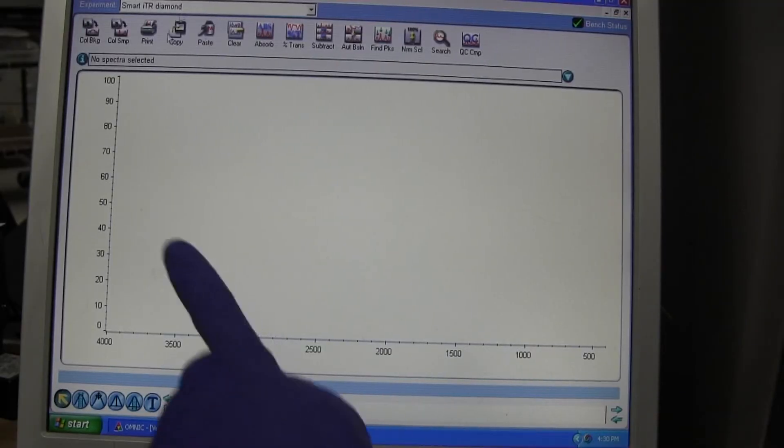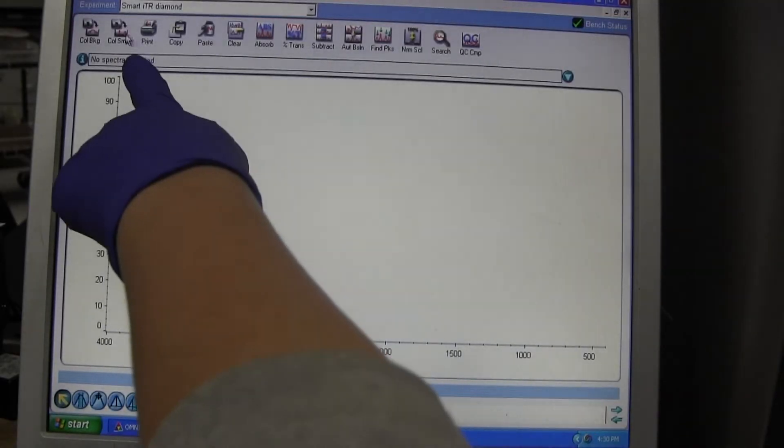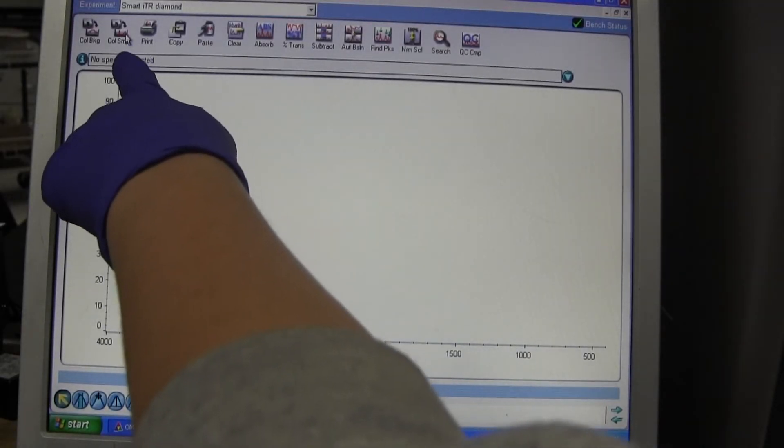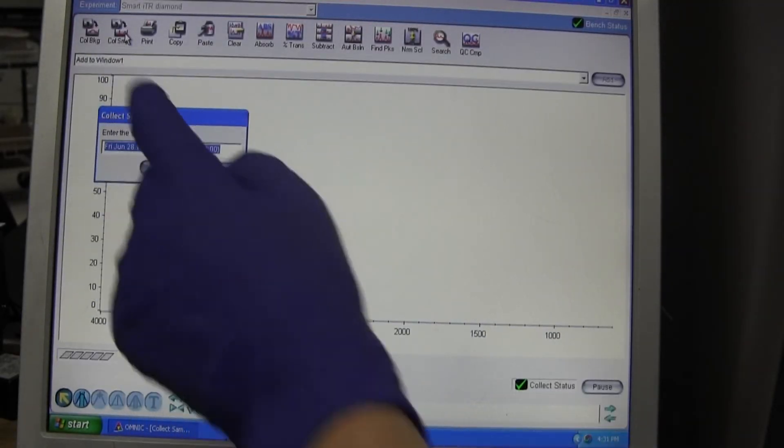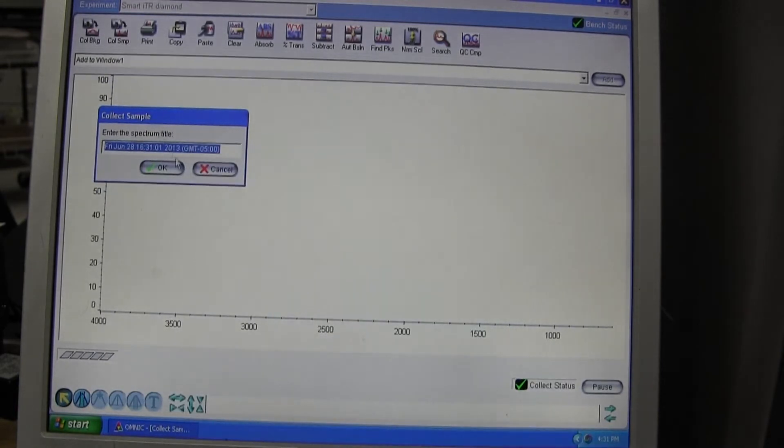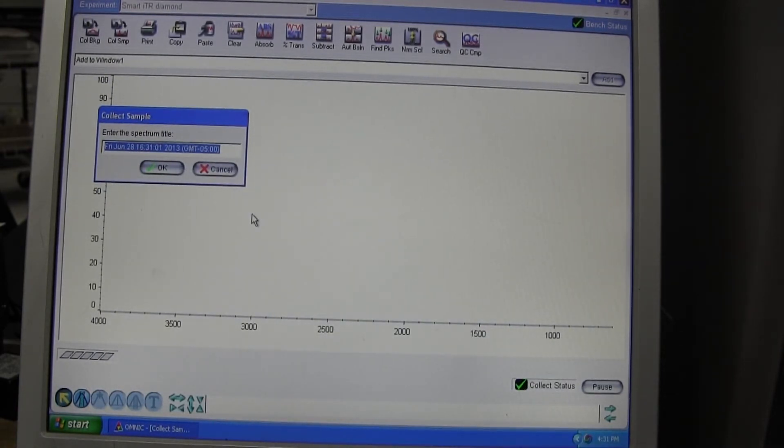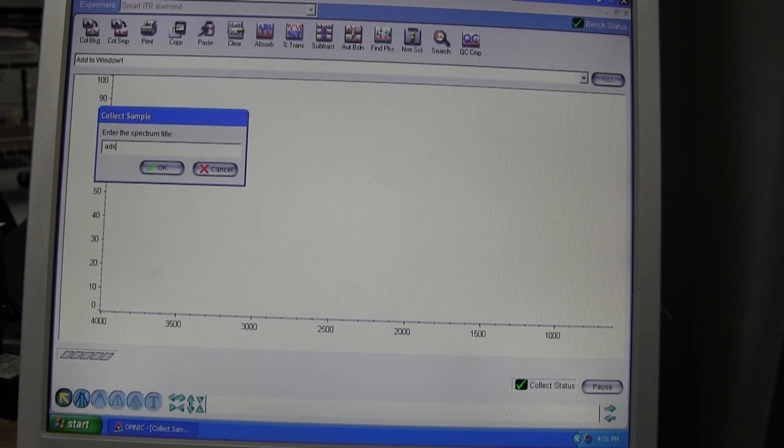Next, you will collect your sample. Select the Collect Data button from the menu at the top of the screen. Then, input a file name. This should include your initials, lab day, and the title of the lab.